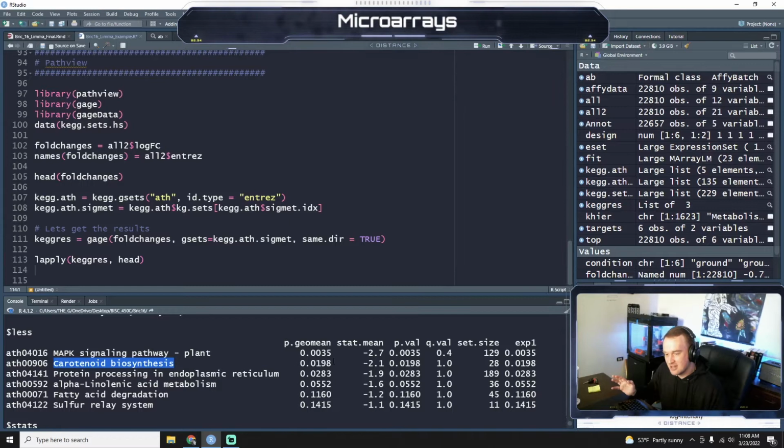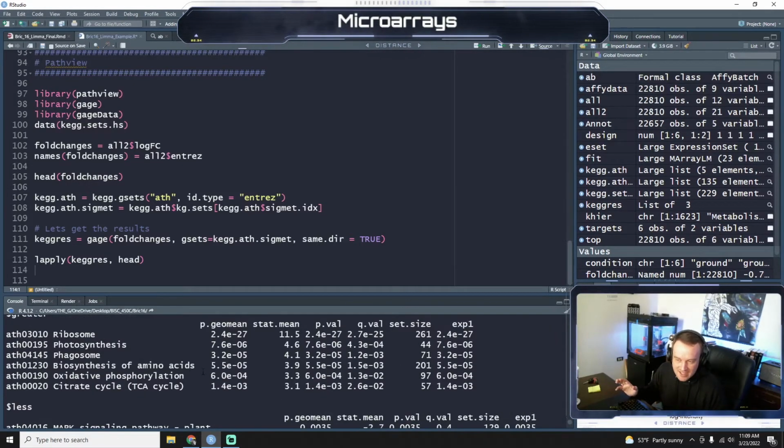Well, it might be downregulated a bit, because our uncorrected p-value was significant, and we have to acknowledge the shortcomings of our experiment. We only had 3 replicates for each, 3 flight and 3 ground control. So this might be because there's enough error in the biology and the experimental design that we couldn't detect this. It was close but not fully detectable.